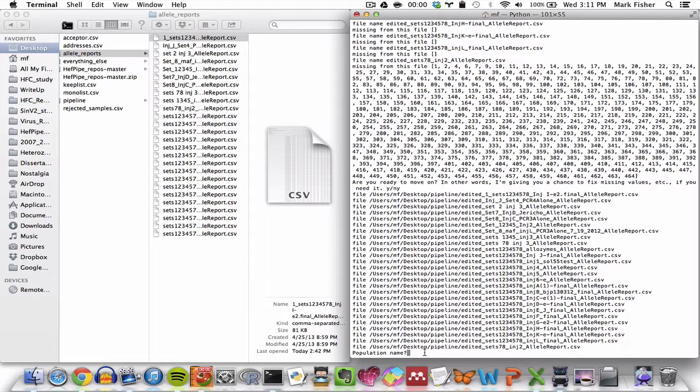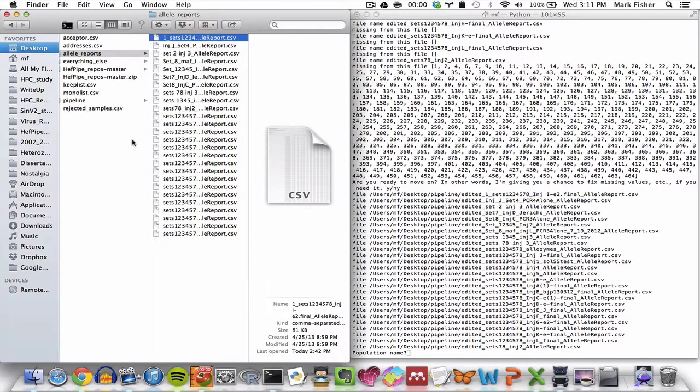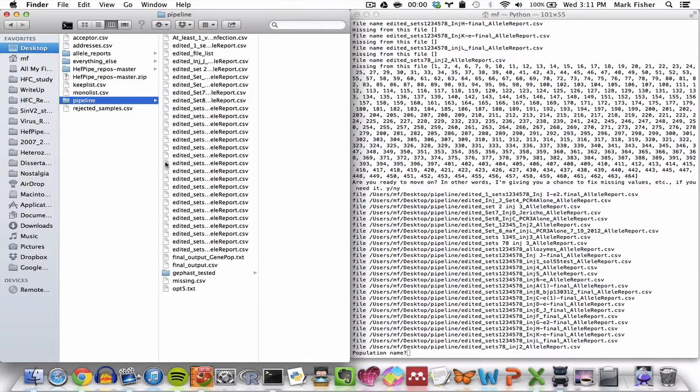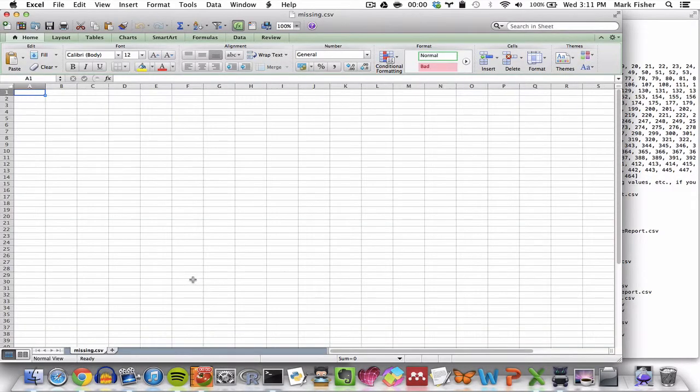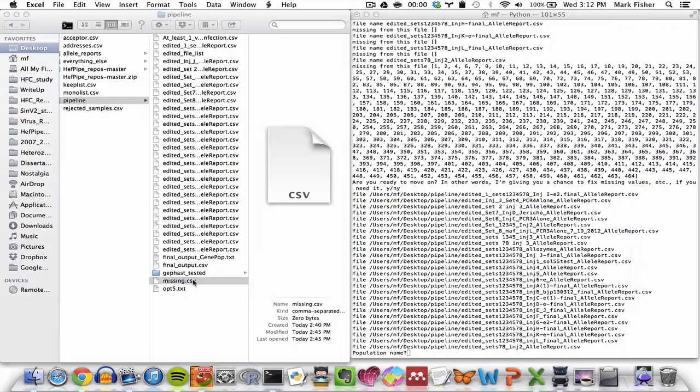Okay, so we've waited a little while and now let's take a look at this missing.csv file. And you can see it's empty in the example data, which is exactly what we want. We don't want anything missing.